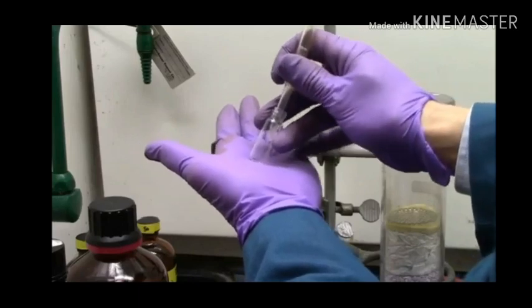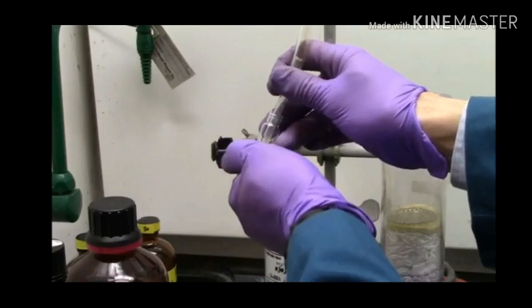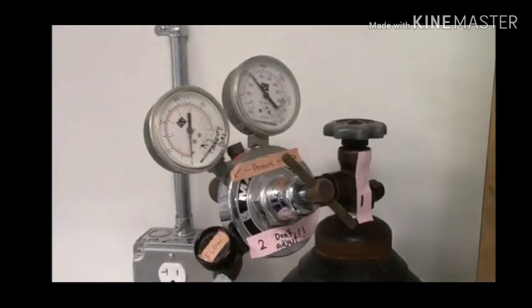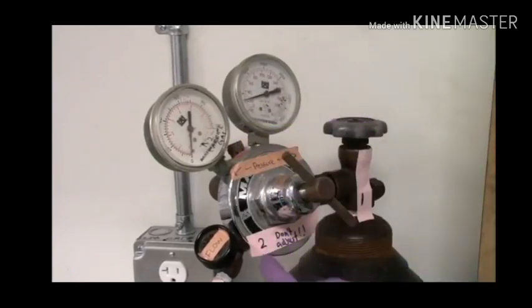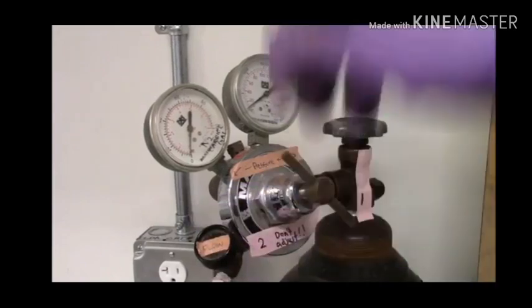Okay, this looks pretty good here. I've just got one drop in the corner. Get rid of that. Warm it up with my fingers. I am done. When you turn off, I recommend you do it in the same order. Turn this off first. This dial will drop. Don't touch this one. And turn off the flow rate.